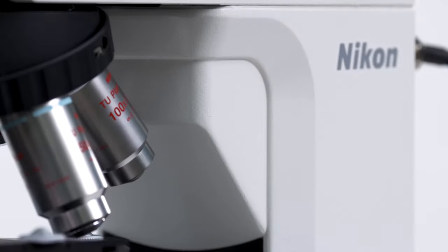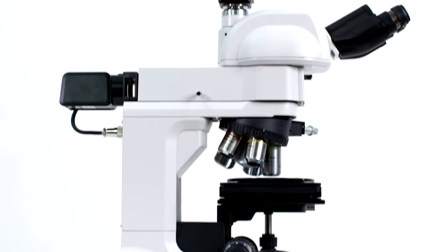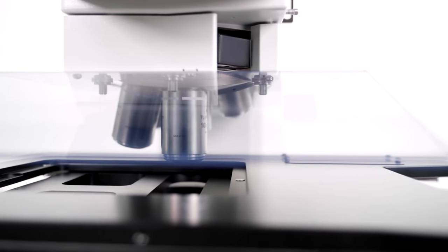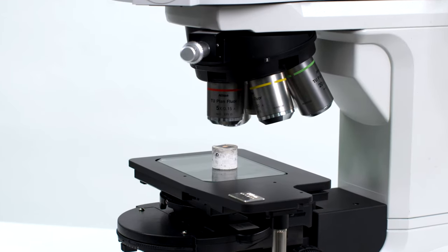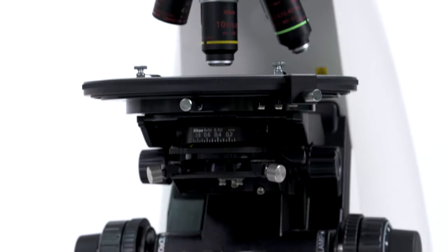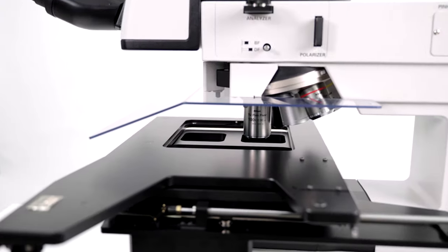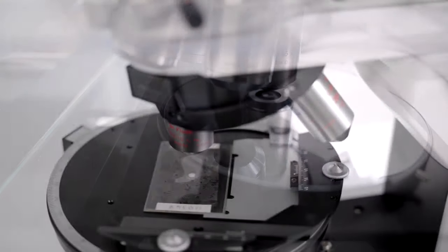All the Eclipse stands share objective lenses from Nikon's CFI-6D optics programme. With the CFI-6D-2, Nikon has added some very thin Fresnel lens elements to greatly extend the working distances and efficiently handle chromatic aberrations, as these new elements are designed to cancel out the aberrations from the normal lens elements.